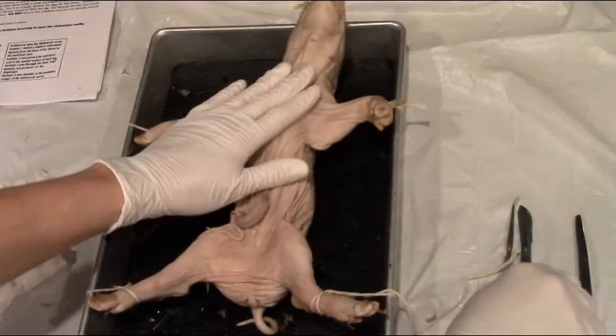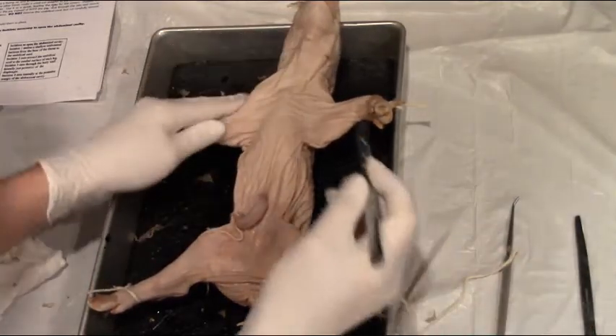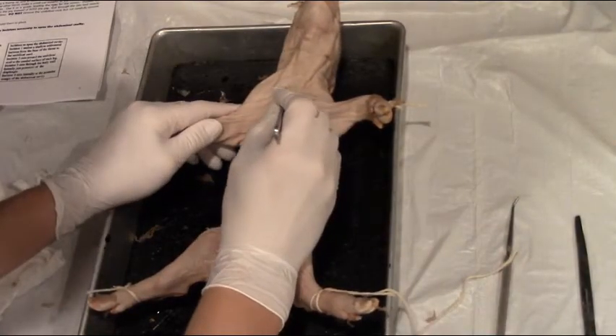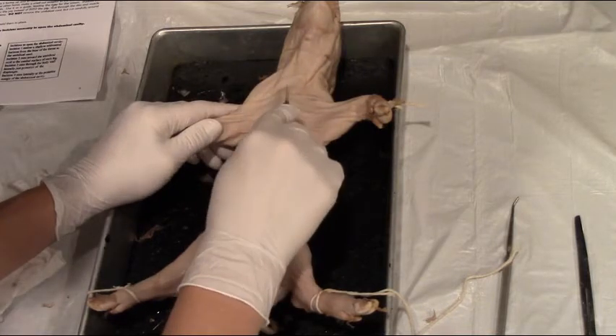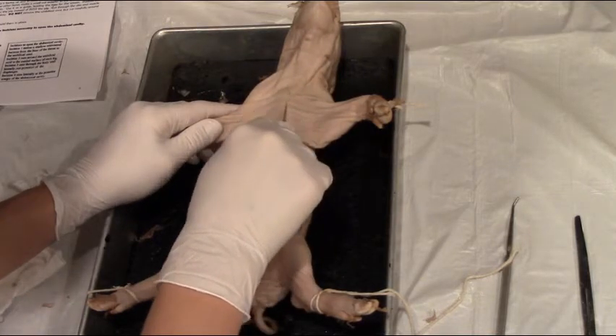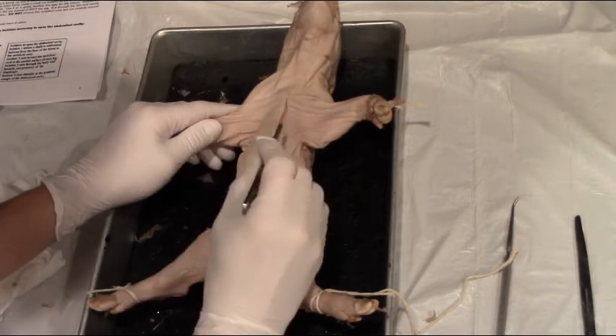We'll take a look at how to make those first incisions into your pig. My first tip is to start cutting shallow. We want to go slowly and be gentle. We don't want to risk cutting into something accidentally or making incisions that we're not sure of.